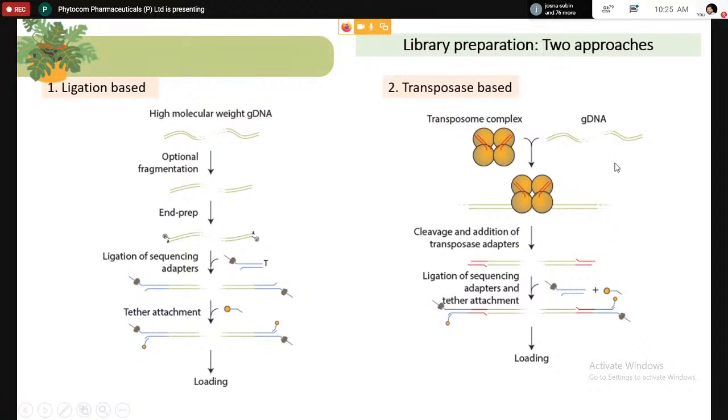You can isolate the DNA, mix it with the transposase-based sequencing reaction mix, and load it into the SmidgION. You will get the sequence. So these two steps are for when you are not doing multiplexing, just a single sample. You are not adding any barcode for identification of different samples.